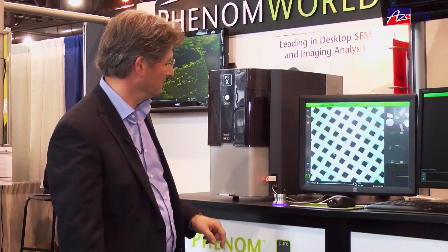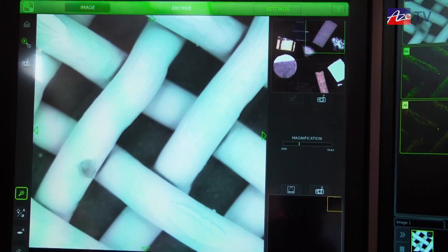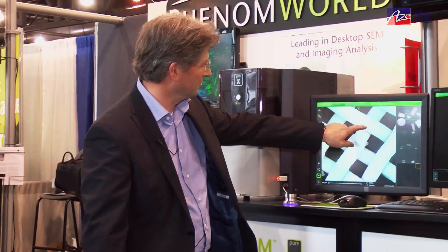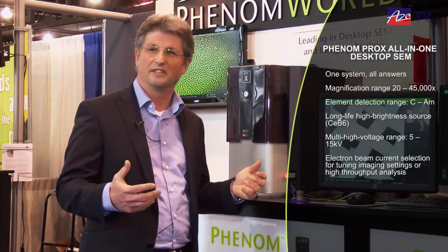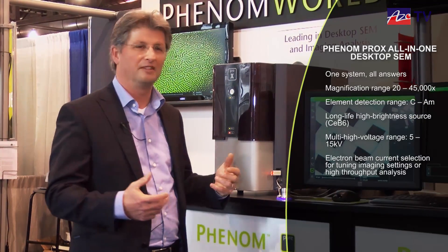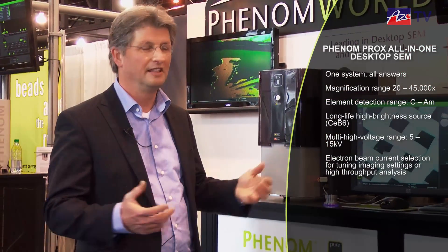This looks interesting, so I'm putting this in the center and turning up the magnification a bit more. This is something that looks worthwhile looking at. Basically this is the first step — most customers by now would say they know what their production output looks like: it's okay or it's not okay, they're happy or unhappy. At this point they could decide to get the specimen out of the Phenom and they're done.